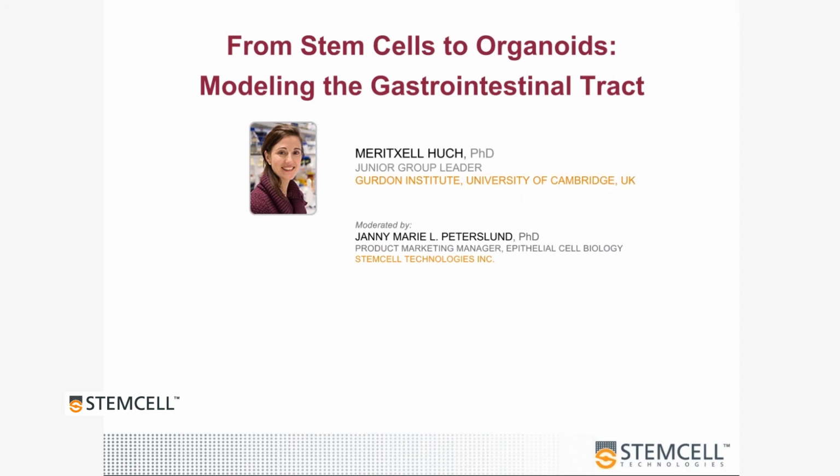Infecting these cultures with bacteria was a bit challenging because the lumen is inside of the organoid, so the outside part of the organoid is the basal part of the cell, while the apical part of the cell is inside. So we literally had to inject the bacteria inside of the organoid. But it was possible, we did it, yeah.